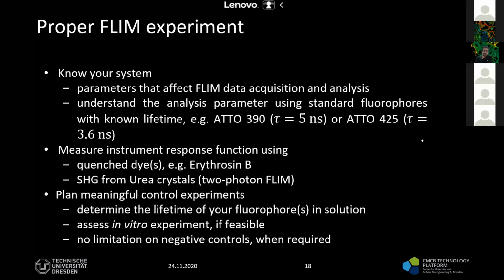But as far as I know, rapid FLIM is a fast way to acquire FLIM images. It's different from fast FLIM. Fast FLIM is a way to visualize the temporal information very fast, to give you a rough estimation of what you're looking at in the lifetime domain.